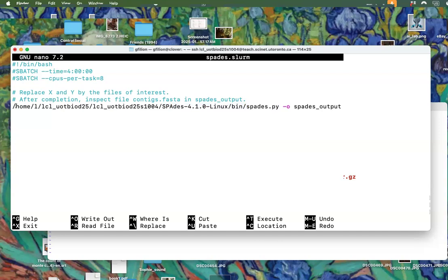So that here is me installing Spades version 4.1 yesterday, and you're just going to use my version of Spades. So that's why you need the entire path, but you're not copying it, actually. The rest will be run from your home, which means mystery1 and mystery2 will be looked for in your home, not in my home. And that's why you copied them in your home.